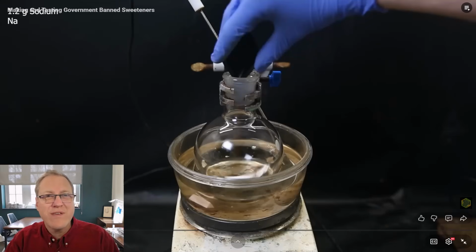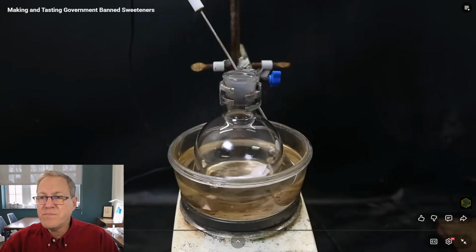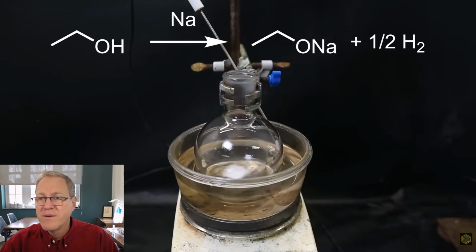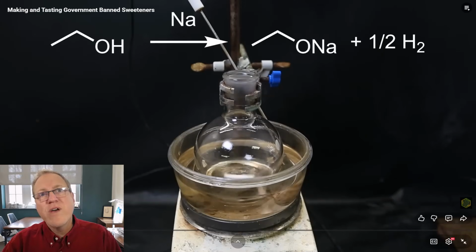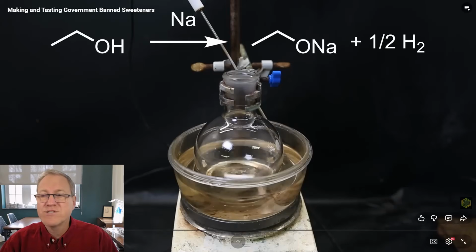That's because it's fizzing because of the formation of that hydrogen. Before I continue with the next step, I have to wait for the sodium and ethanol to react completely. In this reaction, ethanol reacts with sodium to form sodium ethoxide, and those vapors are probably ethanol vapors that are being pushed out, but they're being pushed out because you have this fizzing hydrogen gas forming in that reaction as the sodium reacts with the ethanol.